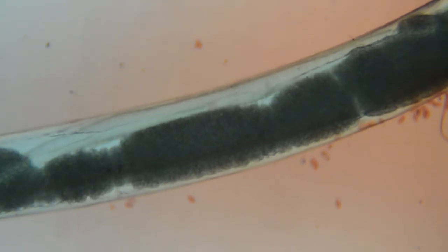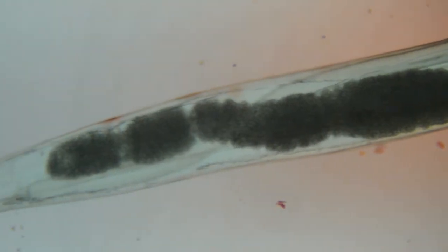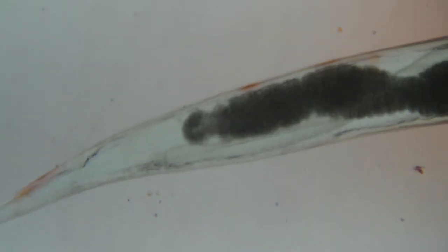We can see the mass of eggs moving on the inside of her body and they are looking for a way to get out. Now look at how she tapers down to the tail. The tail end is very pointy and sharp, much like a pin.